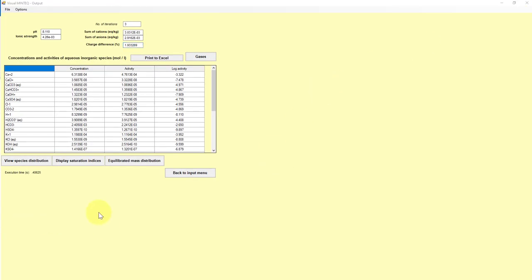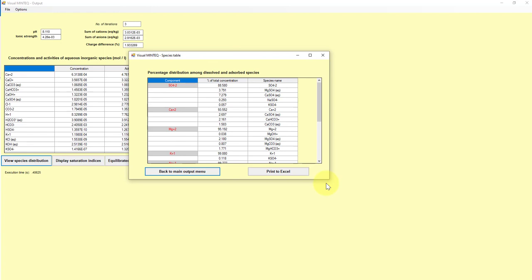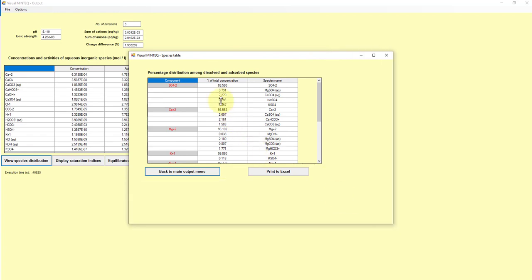Okay, a couple other things that are cool about this that would be relevant are these two buttons down here. So view species distribution shows all of these various species, but then it ranks them by percentage presence in that solution.